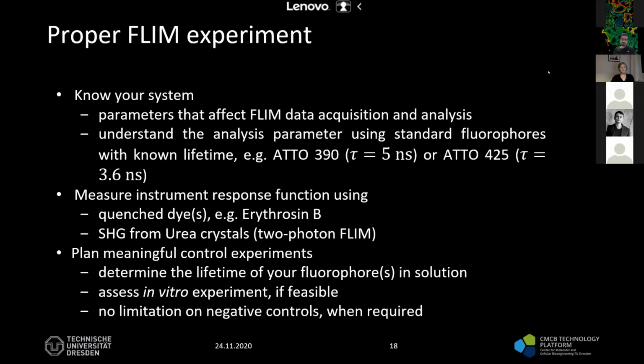There might be slight differences from lab to lab and instrument to instrument, and these differences can come from the quality of the optics, the different laser models or the companies they are using, or the specifications of any component on the optical path. Plus, there is software in between which interprets the data for us. That software uses algorithms, and these are implemented differently from instrument to instrument and manufacturer to manufacturer.